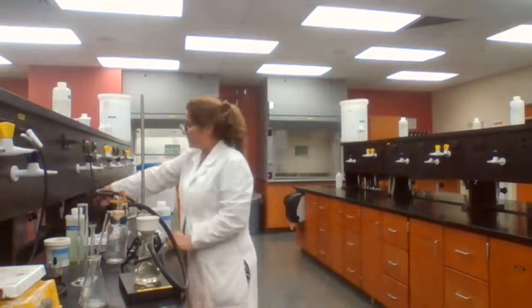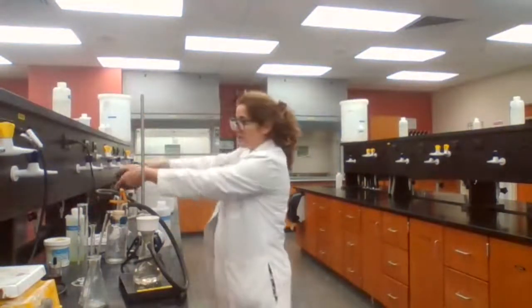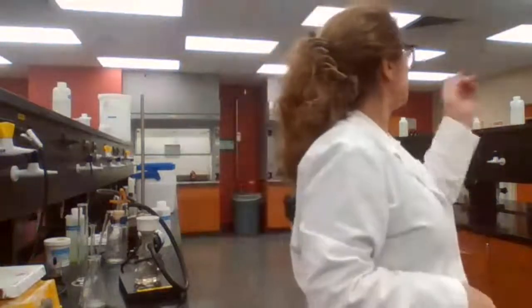I'm done with the ice bath. Only water can be disposed of in the waterway down in the center. All the chemicals should be disposed of properly. We do have containers properly labeled for disposal. And I'm going to show you these containers here.